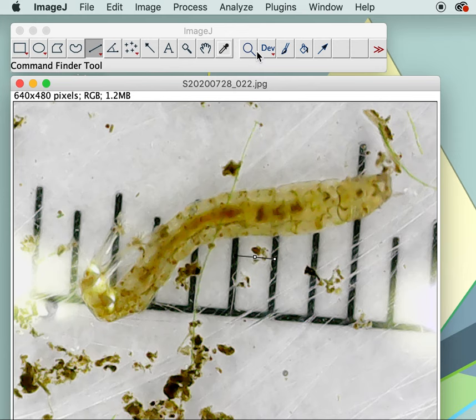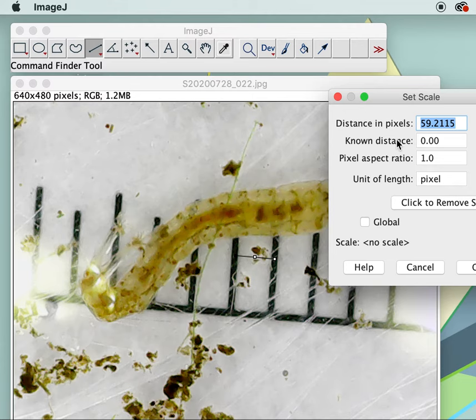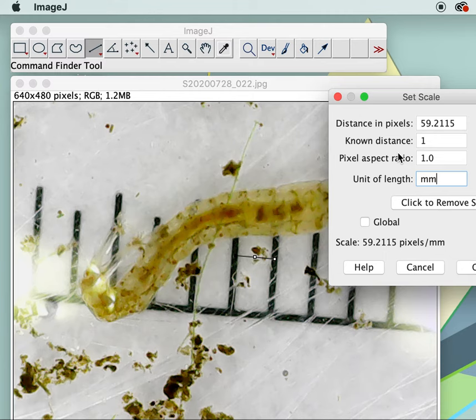Then you go to Analyze > Set Scale. That tells us that the line was 59.2 pixels long. Our known distance is one and I'm going to change the unit to millimeter. So that means that every 59 pixels corresponds to one millimeter.